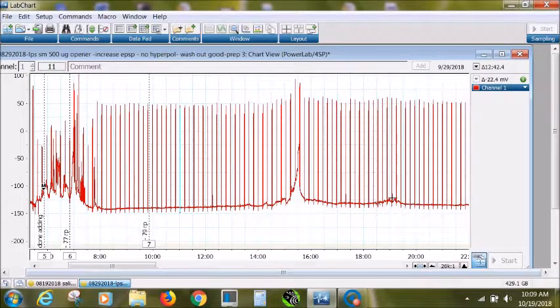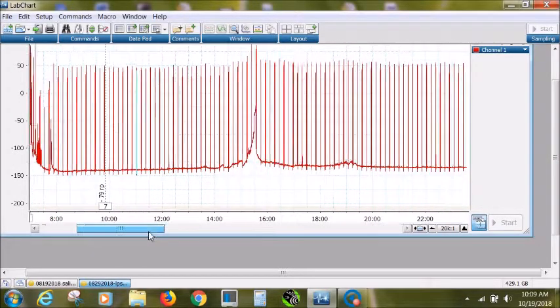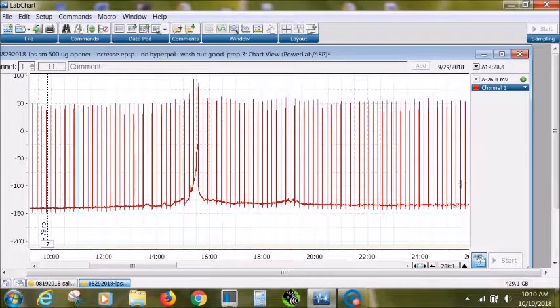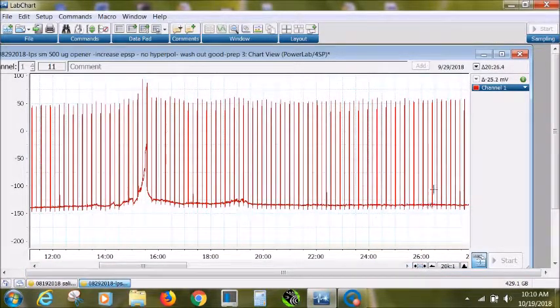And then we're going to go over to 20 minutes, which is right about here.